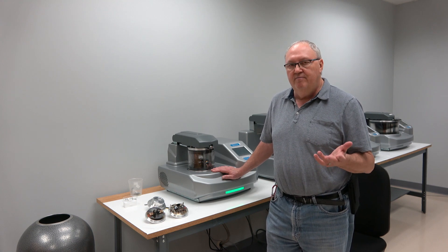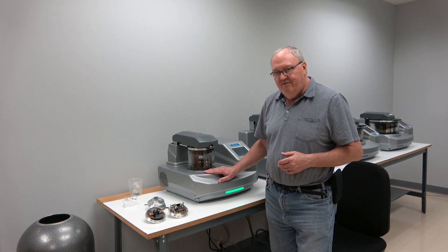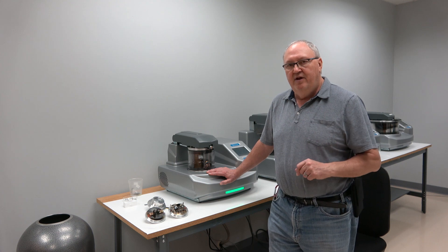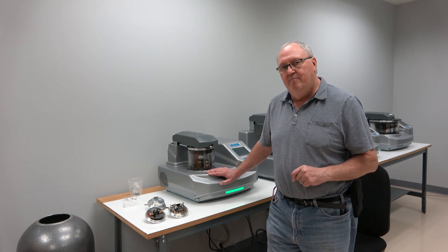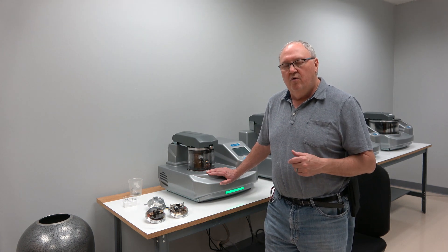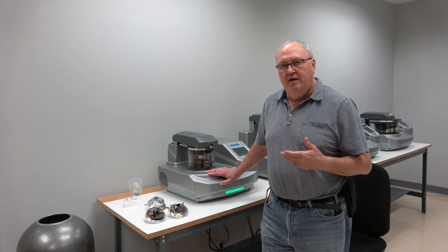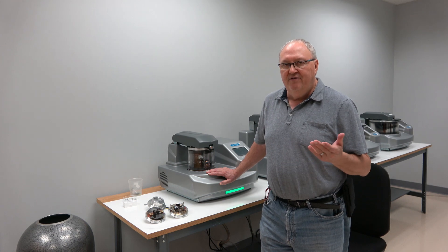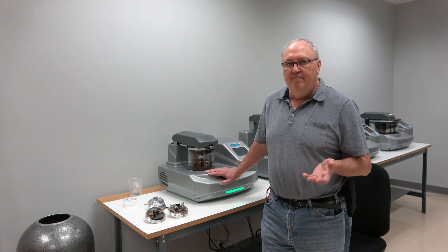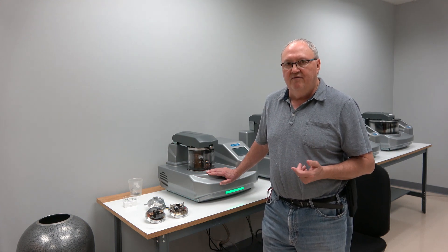A bit confusing, but myself or any of the salespeople can help you sort this out. This happens to be a VES Plus, which has a specially designed pumping system to give you 1×10⁻⁶ millibar vacuum within typically one hour of starting the pump. The 150 T series will give you a vacuum in the middle of the 10⁻⁵ range in about an hour after startup. The 150 R series systems are rotary-pumped, not turbo-pump systems, so they're limited to the high 10⁻³ millibar range and not suitable for high vacuum applications.